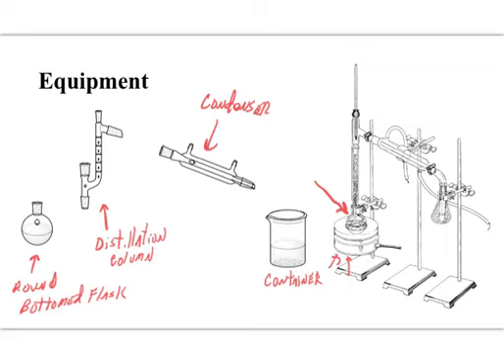Hopefully that'll be the phosphoric acid that's going to be present in that. That'll just be left behind. The distillate is going to go up. There's mention of this copper insert. I am positive that they are not going to have the copper insert.